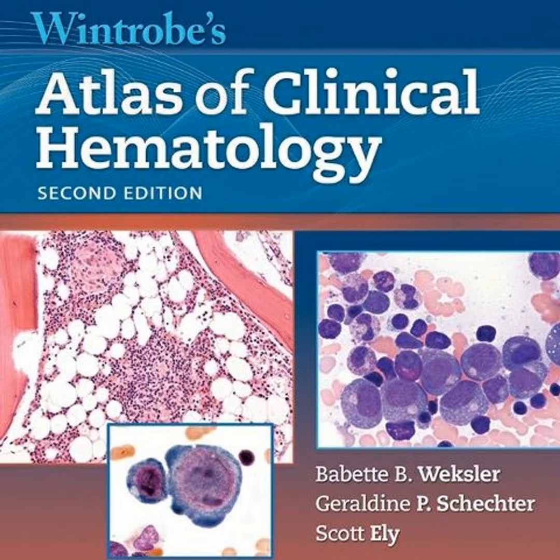It's a matter of diminishing analytical returns. The real clinical power of flow comes from looking at two-dimensional scattergrams and a technique called gating. Gating? Right. You draw a gate around a population of cells on one plot to look at them on another. Too many colors just makes the plots overly complex and the analysis a nightmare. A focused panel is much more effective.